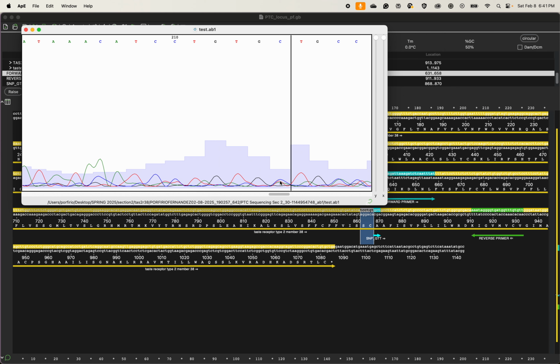This may mean that this might be a heterozygote on our hands. The nucleotide right next to it got called perfectly. It's definitely a T. So I would say maybe, just maybe, this is a heterozygote. And what we can do is cross-reference our other data to see if this is consistent with this idea.